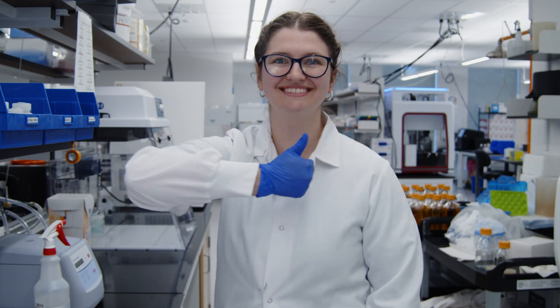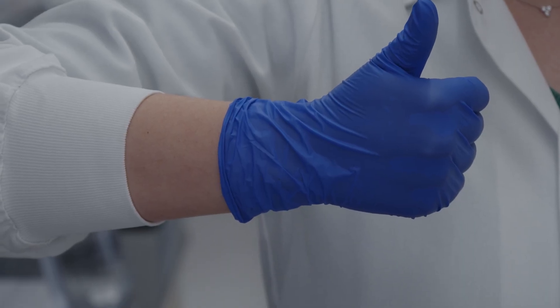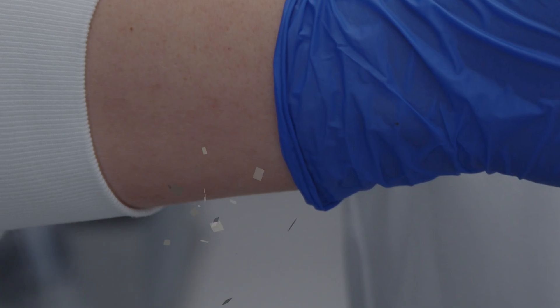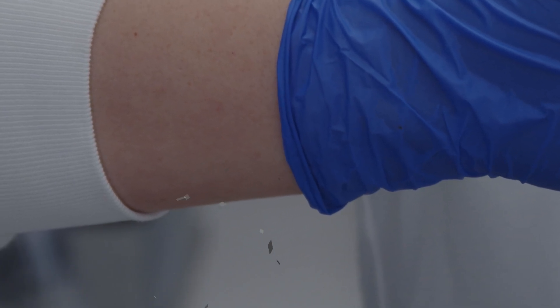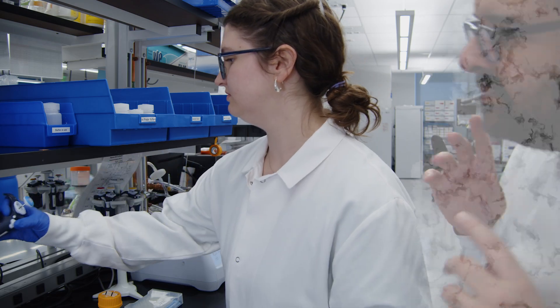Once you're gloved and gowned, check for exposed skin on your wrist or lower arm. You could be shedding skin cells or other debris into your sample accidentally. Some people are just more shed-y than others.